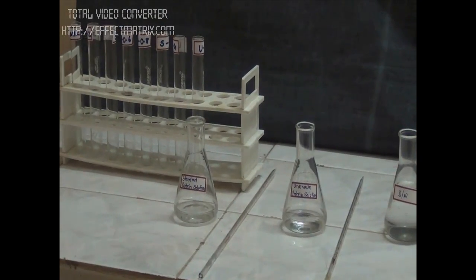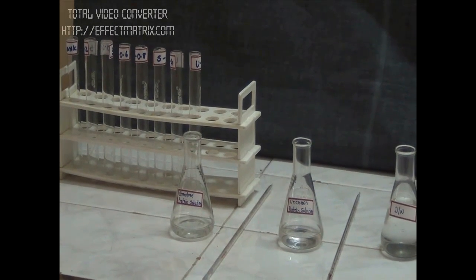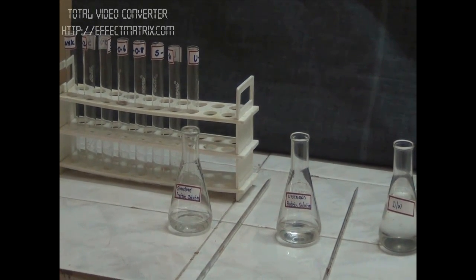First we will prepare a series of standard solution and unknown solution. The first tube is a blank tube in which we will add 1 ml of distilled water. In the second tube, we will add 0.2 ml of standard protein. In the third tube, we will add 0.4 ml of standard protein.